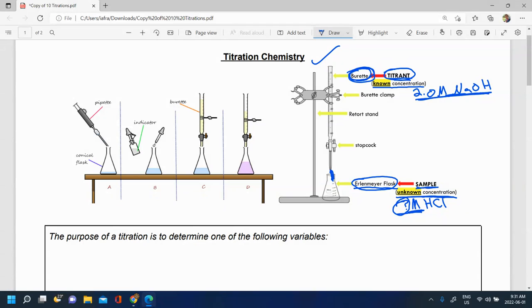So this is the setup. You put your substance of unknown concentration in the flask, you put your substance of known concentration in the burette. The substance of known concentration is called the titrant. Another word for the substance of unknown concentration, we sometimes call it the titrand.